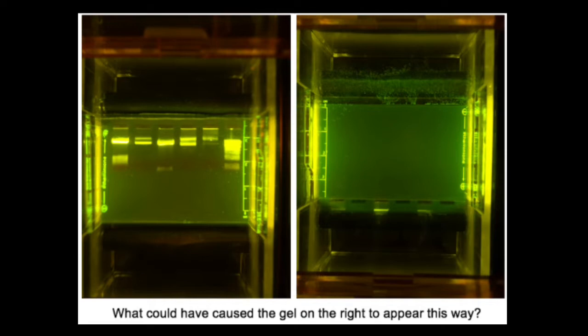Actually, if you take a closer look, we see bands here, but they go in the wrong direction. As you see on this gel, loading wells are on this side, and in this gel loading wells are on this side.